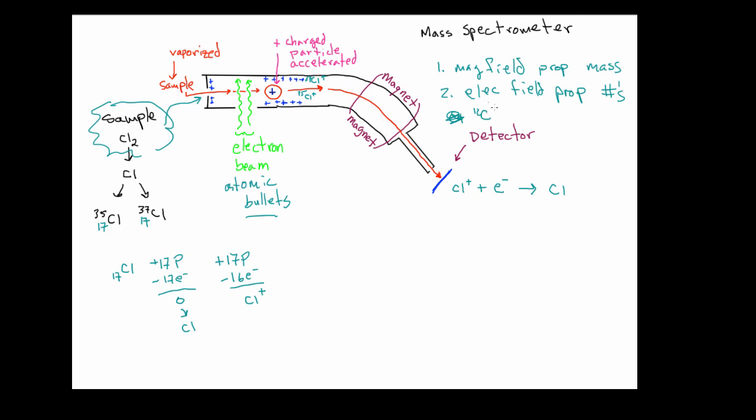We first have to be able to correlate the magnetic force that is causing the deflection of those particles based on a known mass, and then we can count the particles as they hit the detector, and as electrons move from the detector to neutralize each incoming ion.